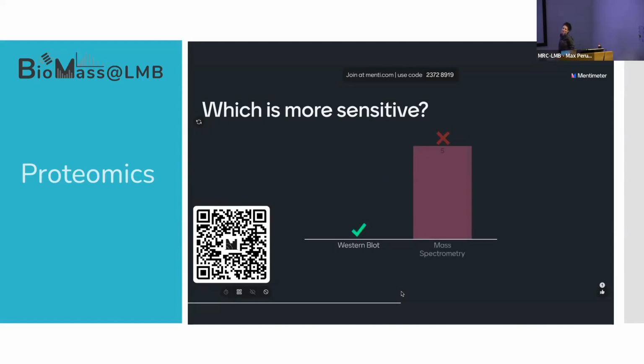I got you. No, not yet. We're actually going really fast towards that direction. But remember that in mass spec, we cannot amplify our answers as you can do in Western blot. In Western blot, everything is amplified, not in mass spec. Unfortunately, one peptide is that peptide, and that's going to be your analyte. There's no way we can go above that.